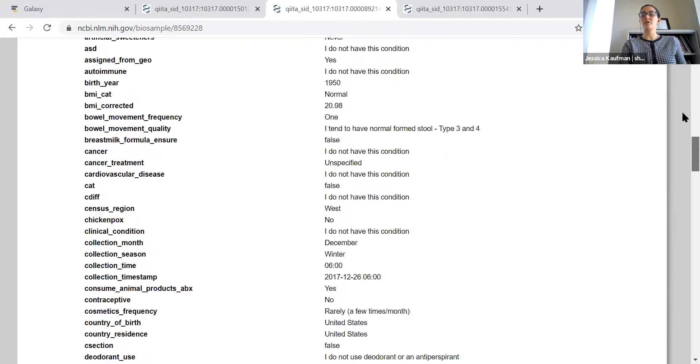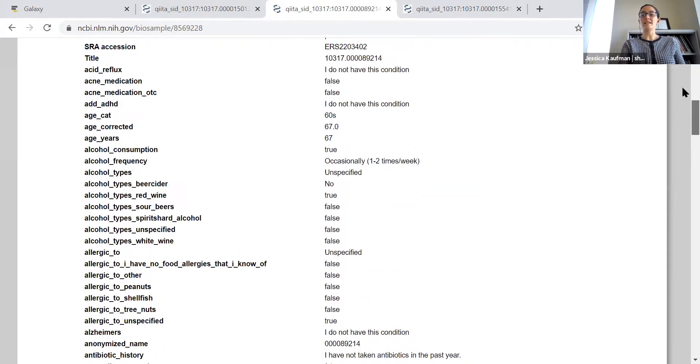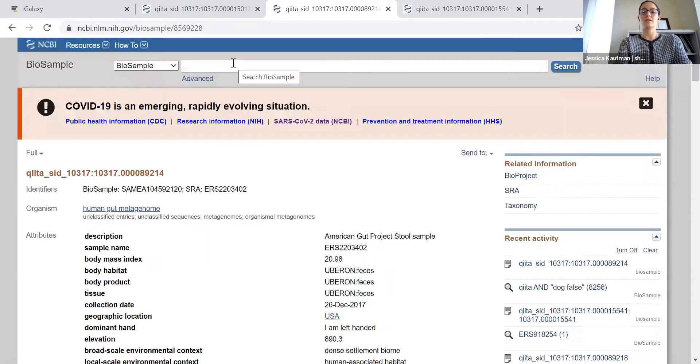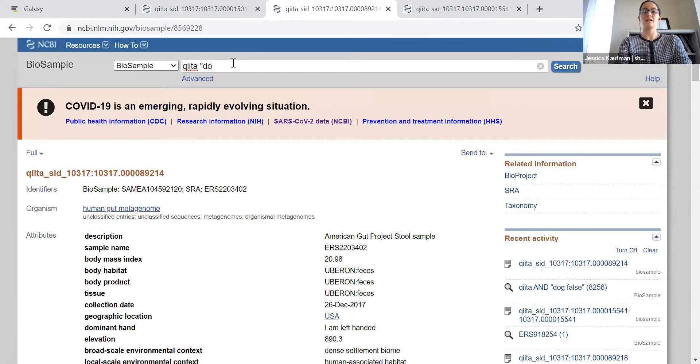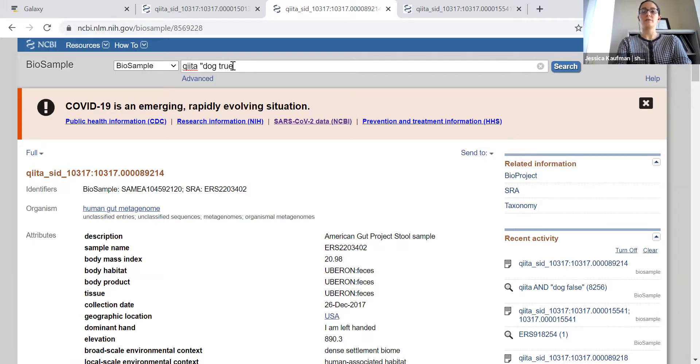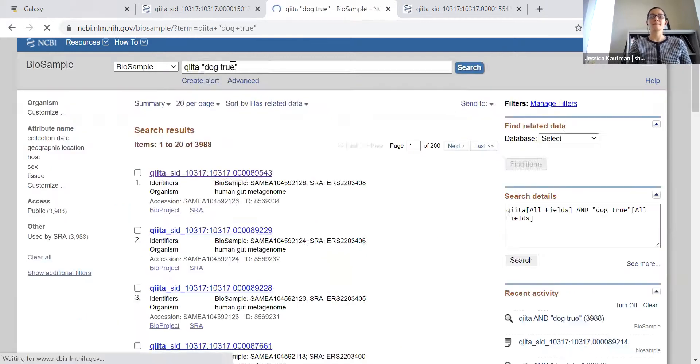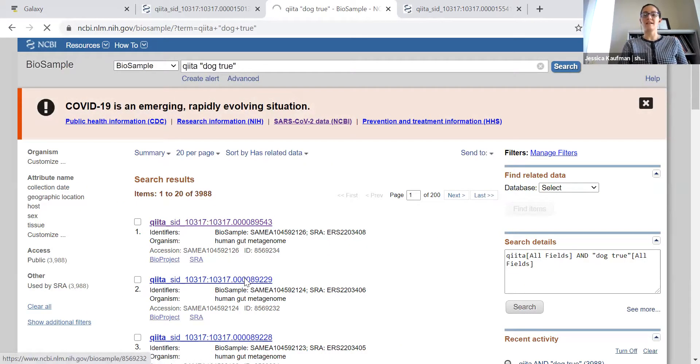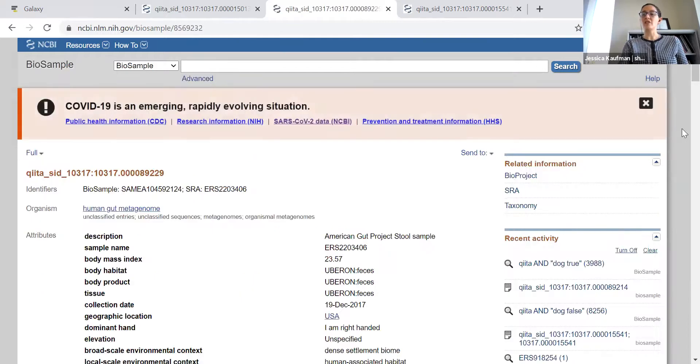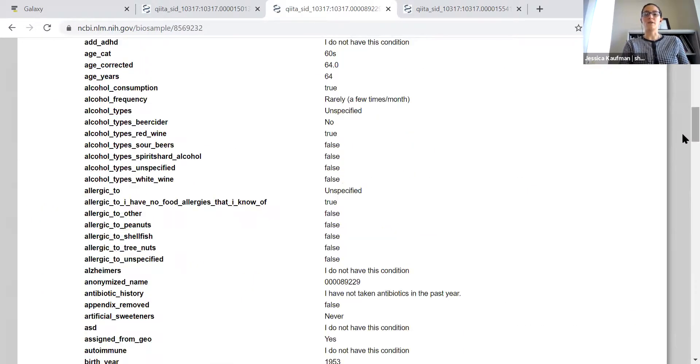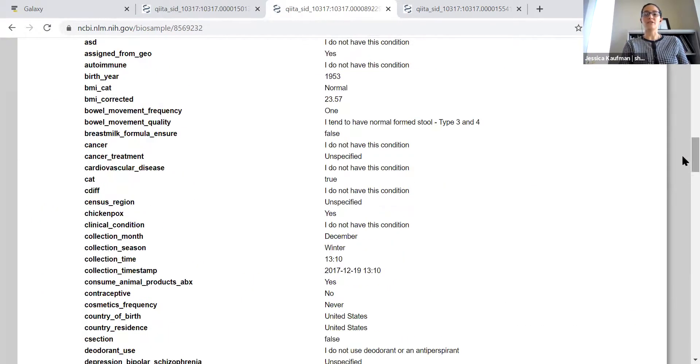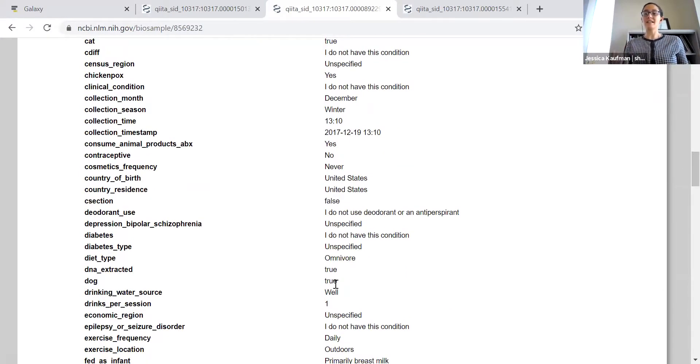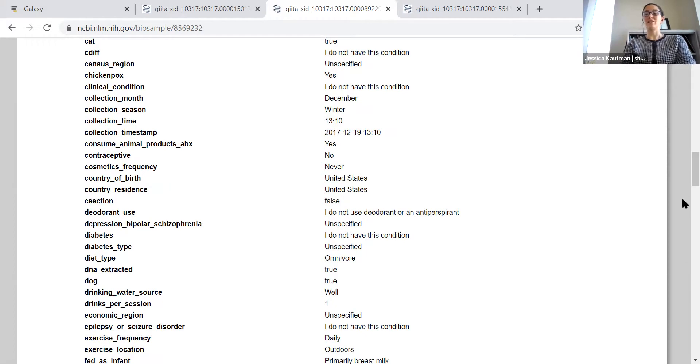Once you've searched for someone that doesn't have a dog, you repeat the search. Q-I-I-T-A dog space true. Now if I click on one of these survey questions, I should find someone who indicated that they do have a dog. That's the first step of the project, finding the two people that you want to compare.